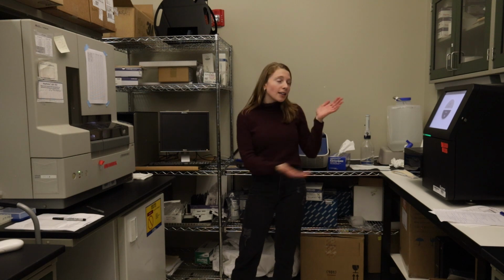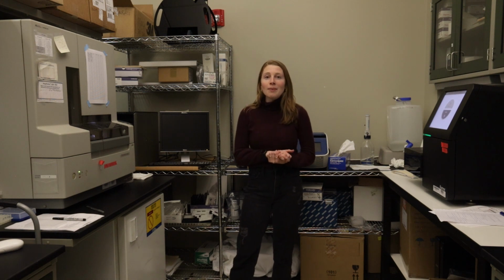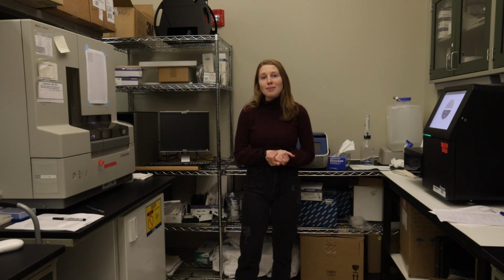So this has been an overview of the Sanger sequencer and the Illumina sequencer. These are used very regularly by students and faculty here at UM. They live in the genome core, and they've been super important for genetics research at UM.